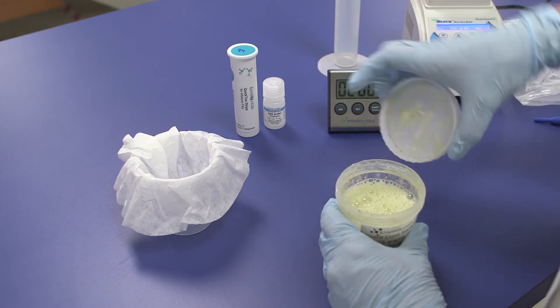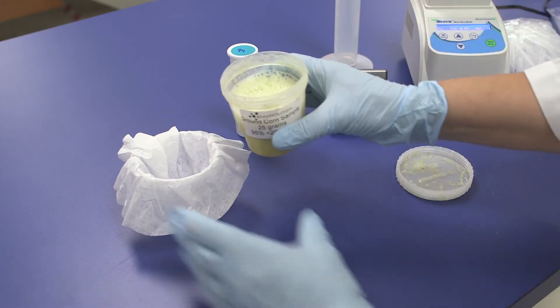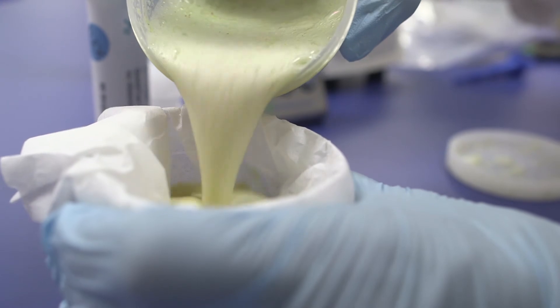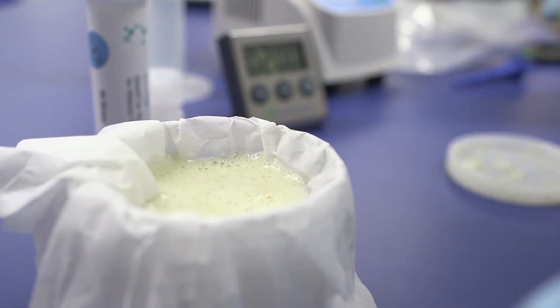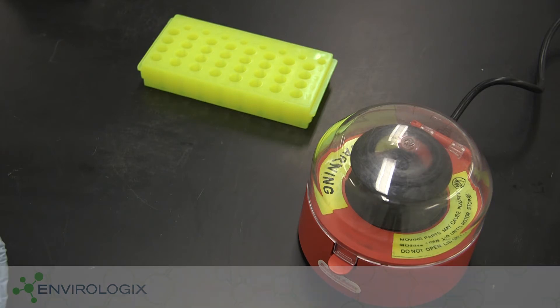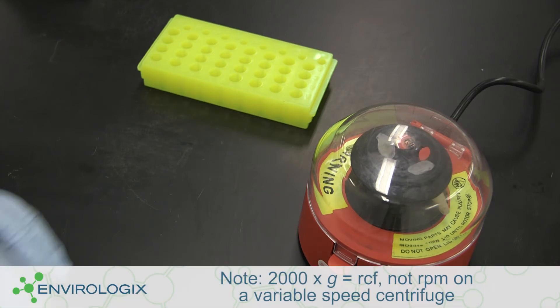Clarify the sample in one of the following ways: Filter the mixture for up to two minutes into a new cup through an approved Bunn coffee filter, or centrifuge for 30 seconds at 2,000 times G.